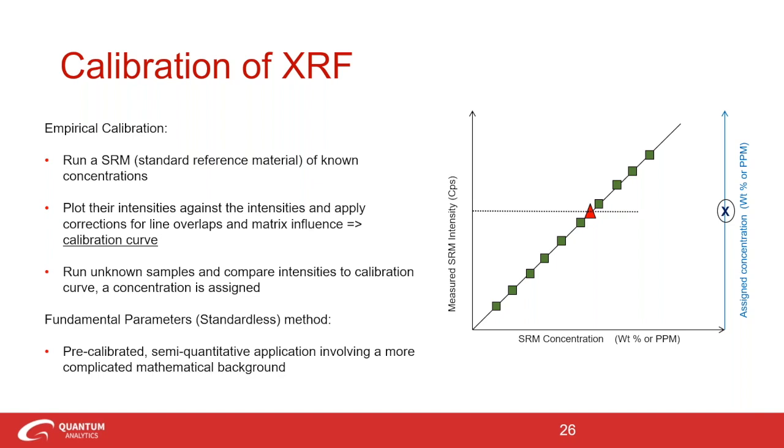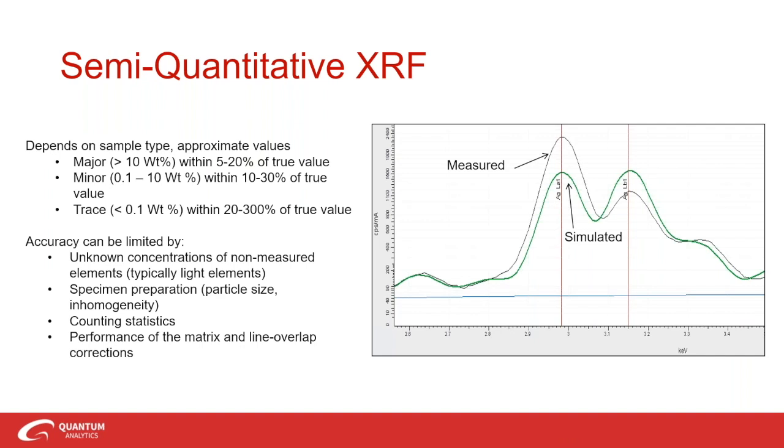It's a really fantastic tool. I love standardless analysis especially when I'm running a number of samples that are just unknown. Someone will send me a sample and say, tell me what this is and how much is in there. Having standardless protocol is a really nice tool to have. At least kind of points you in the right way.